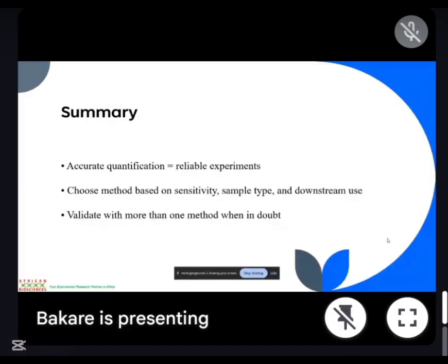If I don't have the three, I can still make use of the nanodrop and the gel, or if it's Qubit that you have available, you can use your Qubit and your gel. But the gel is always important, to do a visual check that the DNA is where it's supposed to be, and the integrity, yes, I have a very sharp band.